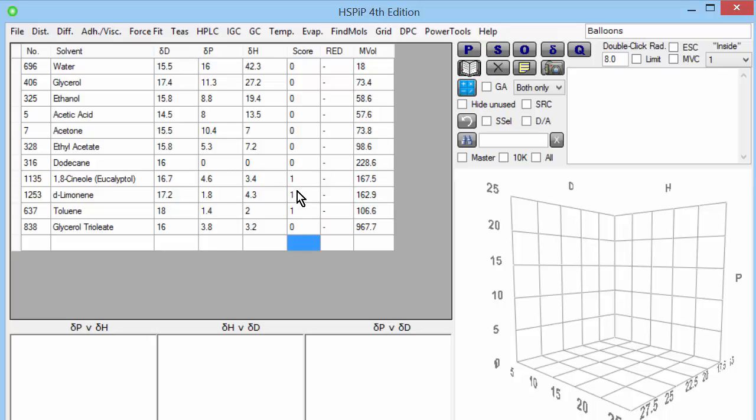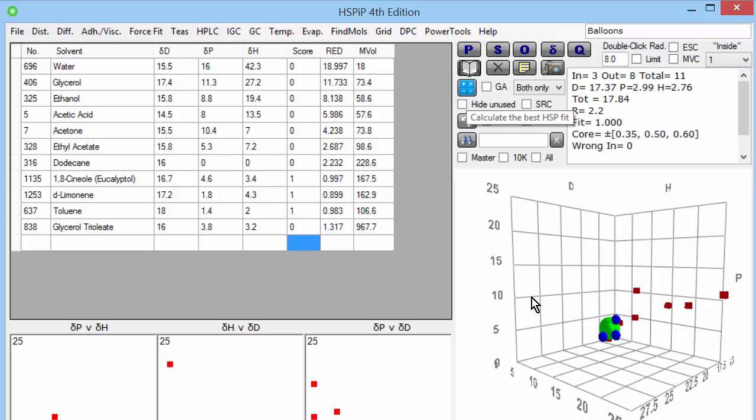We know that the polyisoprene is happy, well with the balloon it was unhappy because it exploded. But the polymer and the solvent were very compatible, which made it explode. So those are the good solvents. So those are the bad solvents. So when we click this, we get this sphere. It's not a very good one. But it tells us the HSP of polyisoprene is something like 17.4, 3, 2.8. Which isn't bad.